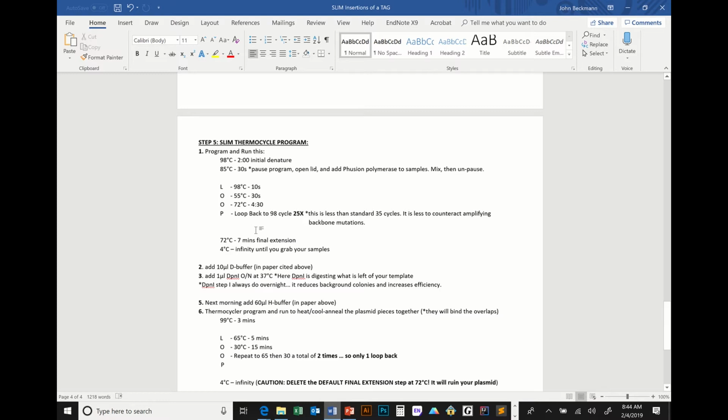So here's the catch also: is it going to work better on small or large plasmids? Yeah, it's going to work much, much better on small plasmids, because you could PCR the whole plasmid without getting a single error if it's 5,000 base pairs. Then you're only going to get an error every 2 times you PCR it.